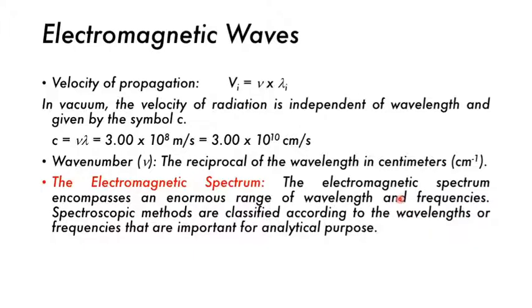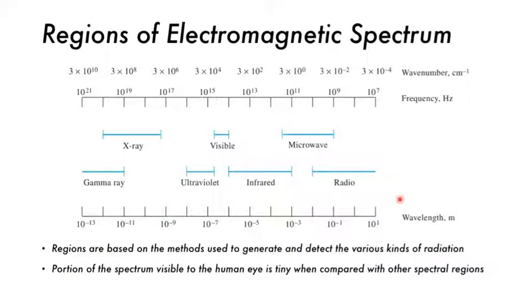For example, UV absorption is based on the energies of the electrons inside a particular molecule. Infrared is based on the bonds which are present, like between a carbon and a carbon or a carbon and a hydrogen. Those change the frequencies which are observed.